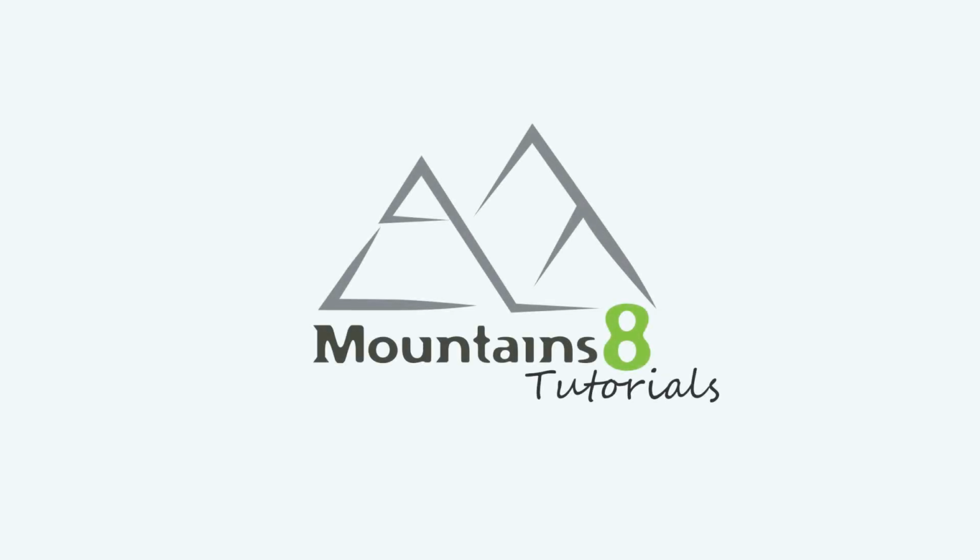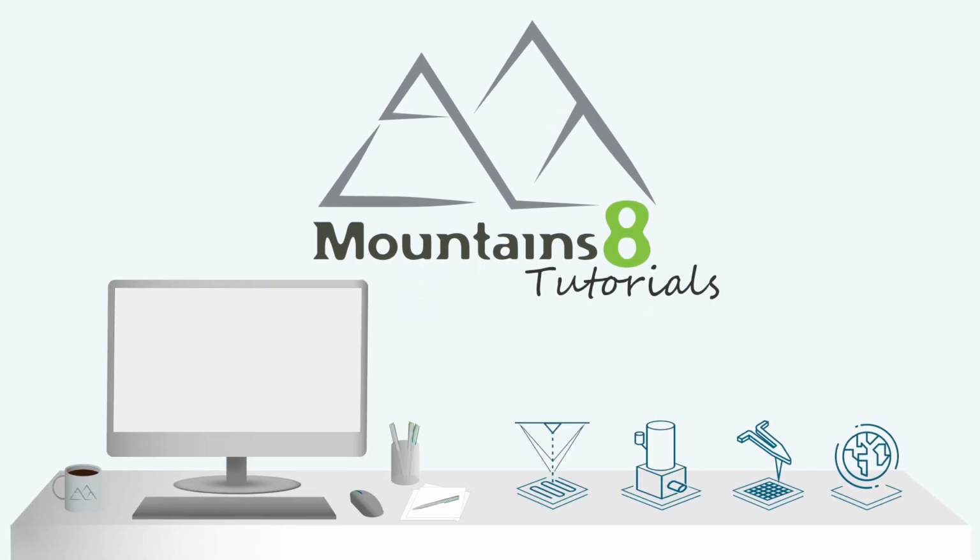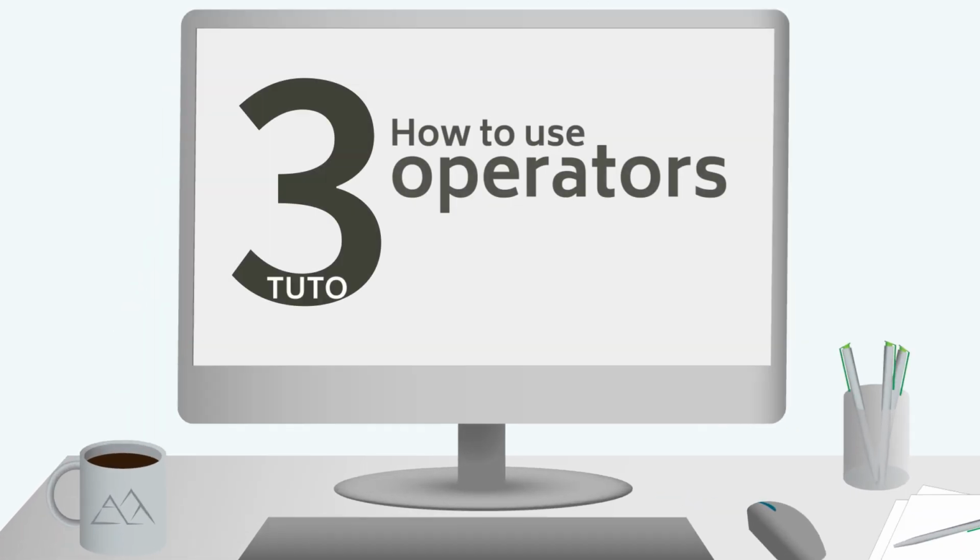Hello, and welcome to the third video in this tutorial series on Mountains, Digital Surf's industry standard software for profiler and microscope data analysis. In this video, I'm going to show you how operators work.